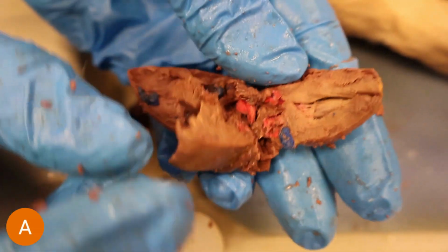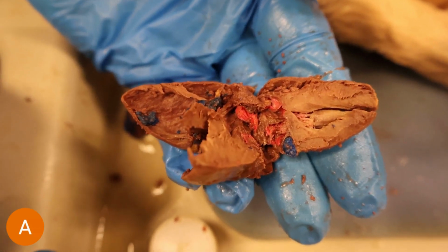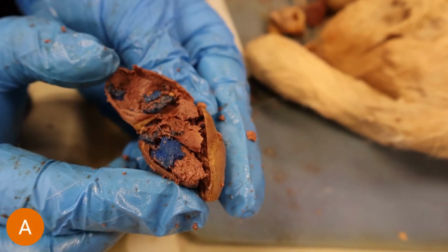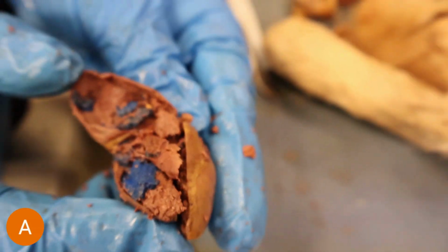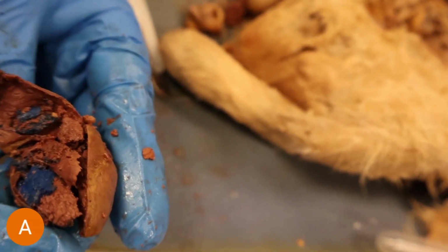The heart is located underneath the lungs. You can see where the lungs are located underneath the rib cage and the diaphragm, and underneath all of those is where the heart is located. The heart definitely helps the muscular structure of mammals, including being able to pump blood as well as oxygen to its different limbs and appendages more effectively.